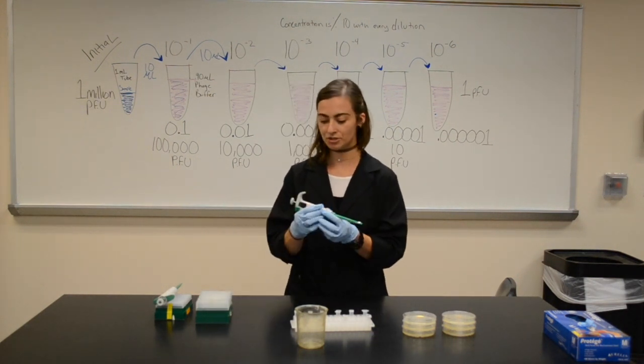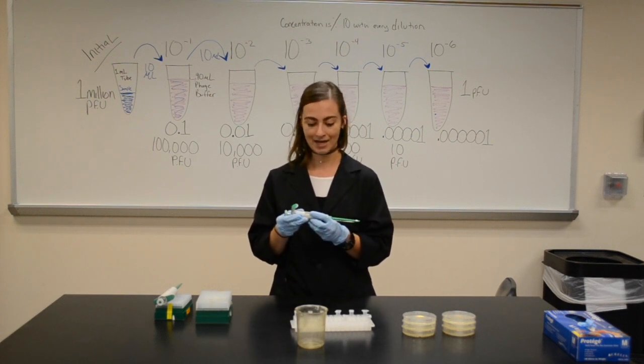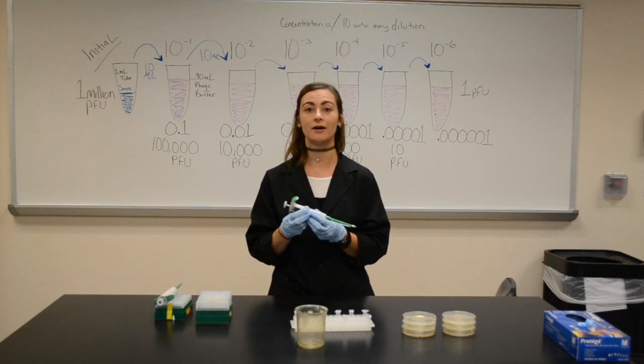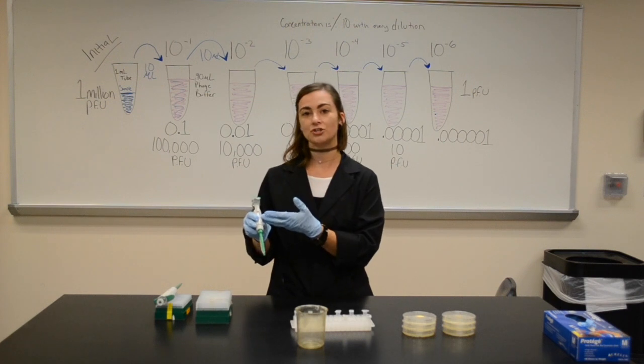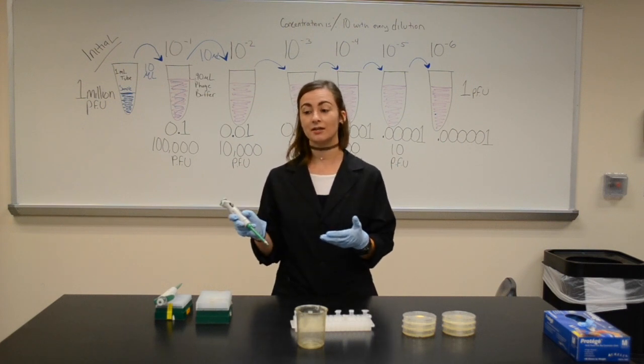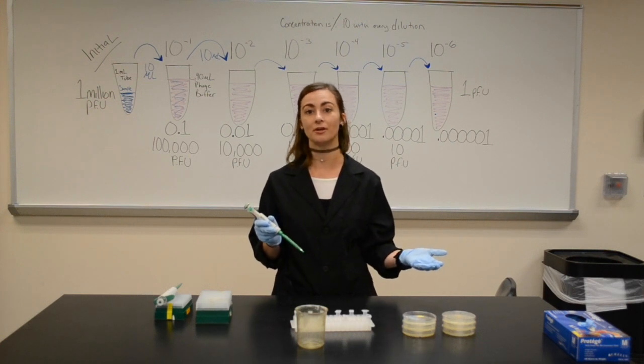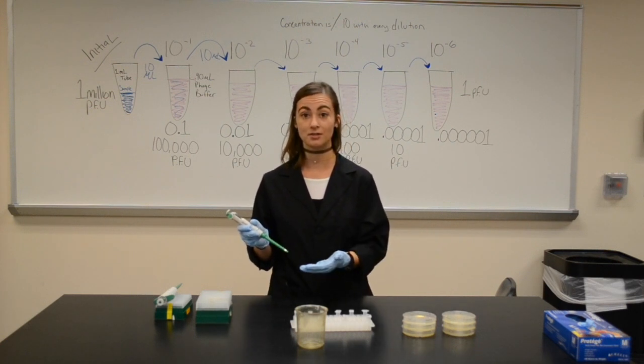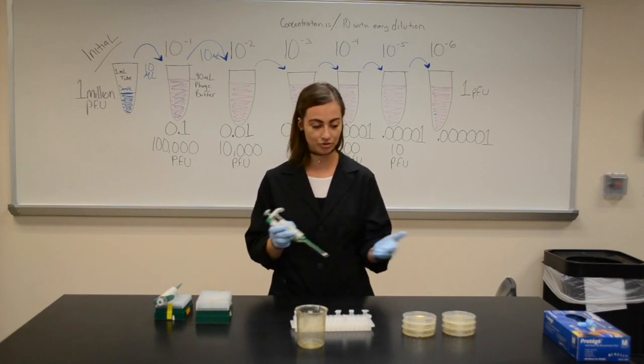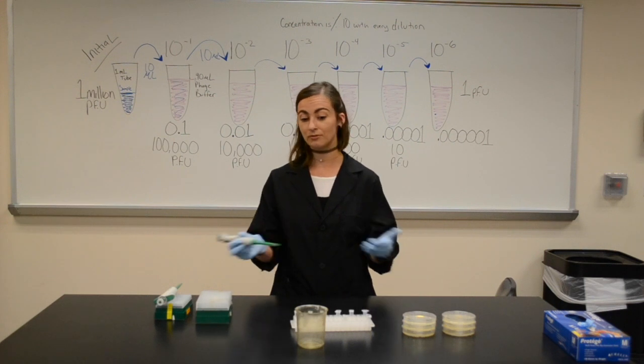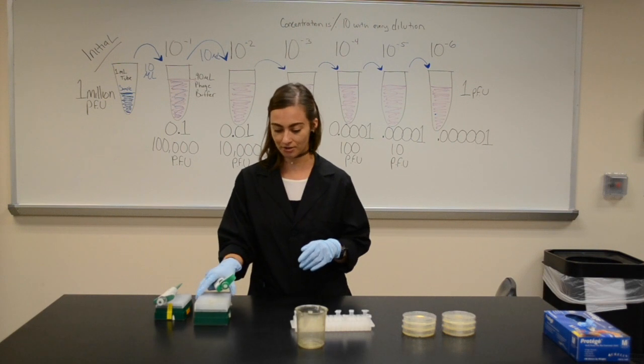First, I'm going to check my micropipette, make sure it's on the right settings. I have done that before actually - talking, not paying attention, not keeping aseptic, didn't change my micropipette settings, and I actually wasted a whole bunch of chemicals that we needed for a different experiment. So that was really embarrassing and also careless. Something as simple as taking two seconds to look, double-check you have everything labeled, you have everything clean, you're doing a good job - it's just important to check the micropipette settings also.